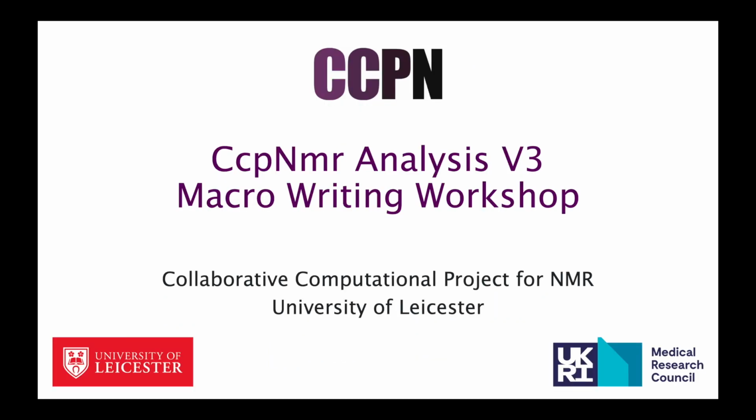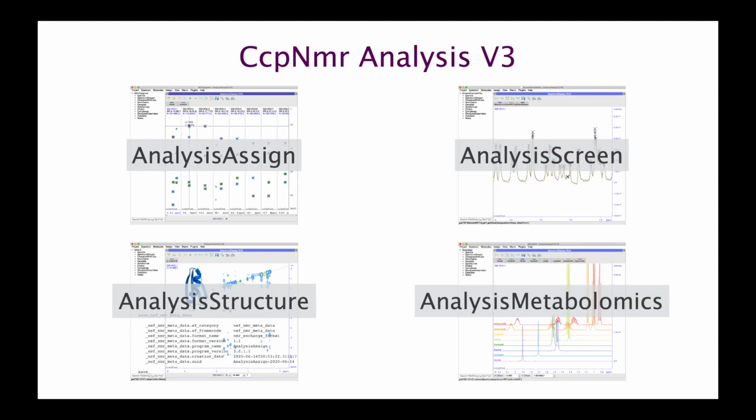This is a re-recording of the introduction to our macro writing workshop, which we held on Tuesday the 5th of March 2024. Now, we're going to assume that you already have the program installed and that you know how to use it. Everything we're going to do in the workshop can be done within Analysis Assign, but obviously it's equally applicable to all the other three programs as well.